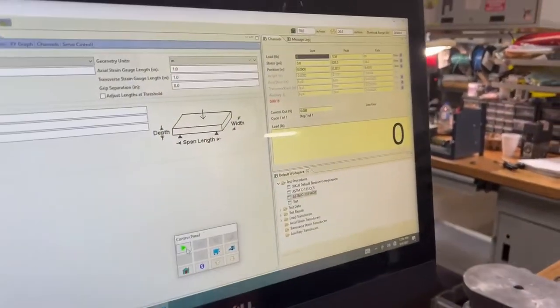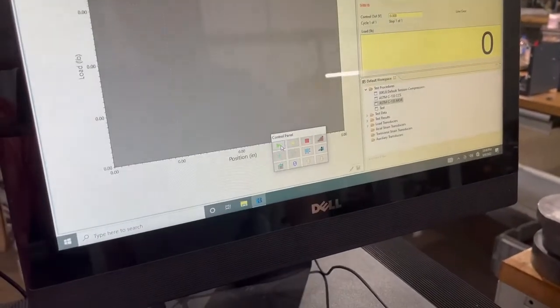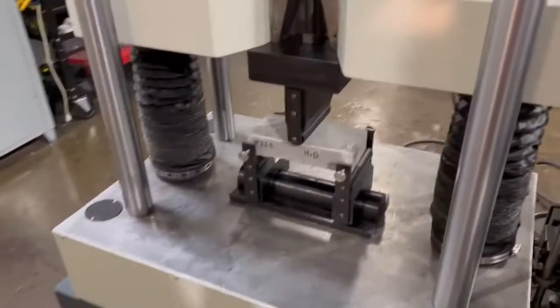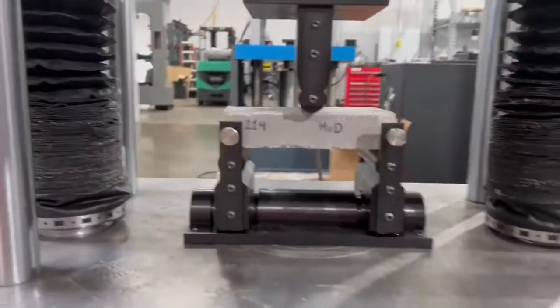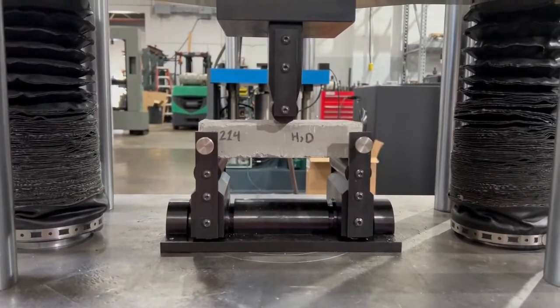Basically, I'm going to zero the test, push start. We got this all set up automatic for a preload. So it's going to come down, sense the part, and begin the test.